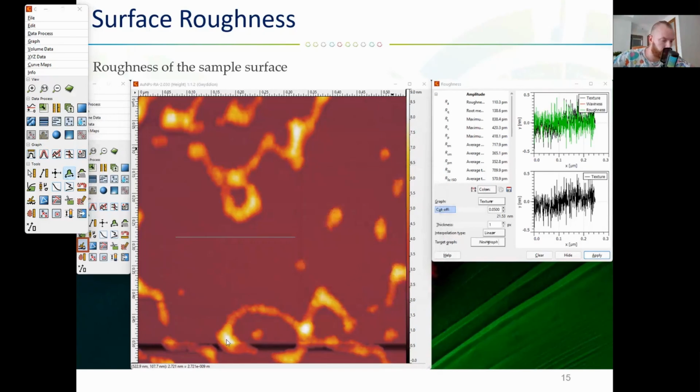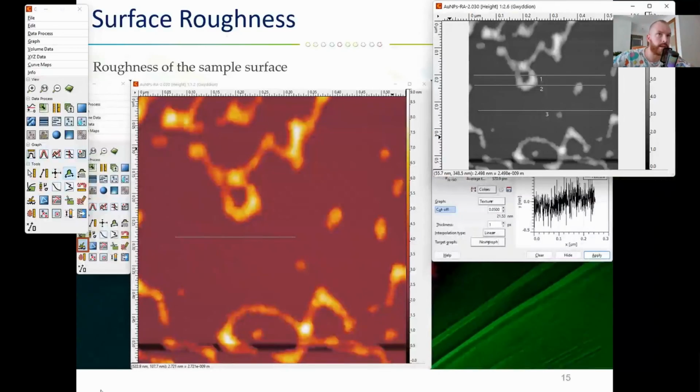Okay, I will close all unnecessary windows. We need this image and we need Gwyddion like this. Yes. Here there is a tool. Again, if we don't press, if we just leave the mouse over the button, we have a small tip. What is that?